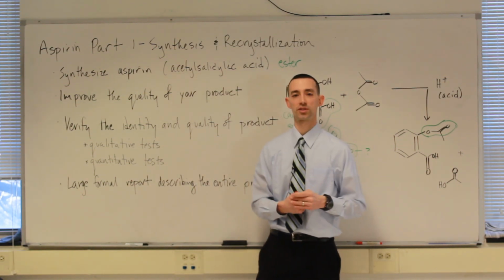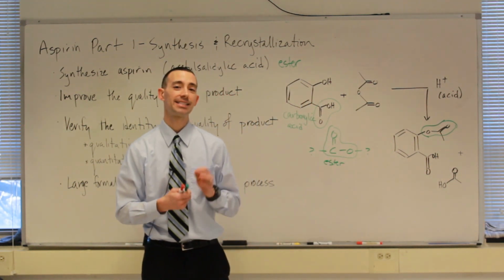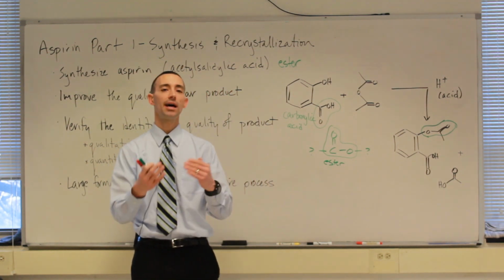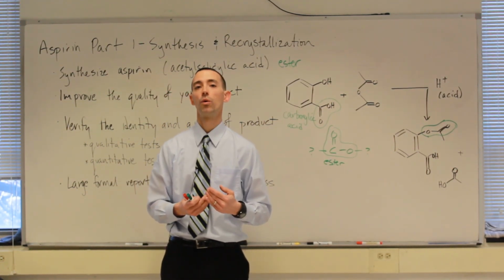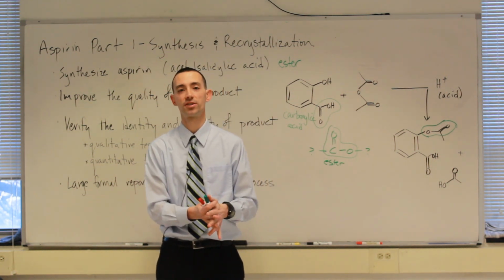What we're taking advantage of here is that salicylic acid is more soluble in water than aspirin. So as that water cools down, the acetyl salicylic acid, the aspirin, will want to leave the water by turning into solid crystals.